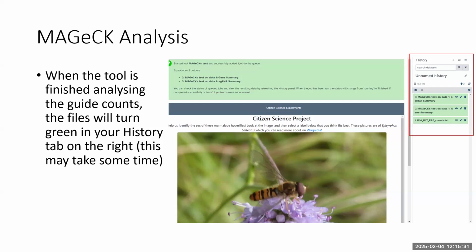And then you want to target close to the 5' end of the open reading frame, because it's going to keep cutting until it introduces an indel. And then you're looking for that indel to put the gene out of frame. The closer to the 5' end, the less of the protein is going to be read correctly, and you'll also probably introduce a stop codon at some point. If it's at the 5' end, it's more likely to disrupt the gene function.